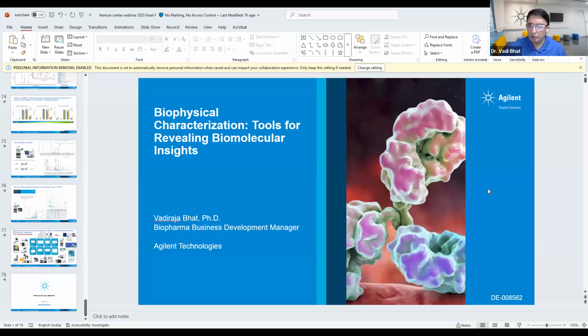So all this sample analysis is done in real time or near real time. Also, on the reactor side, we can fix problems in real time. If you want to supplement the culture media, you can do that. In the downstream, you can make quicker decisions on fractionation or pooling the fractions and going to the next step. And also better quality data, data integration, and digitalization. All this can be done.